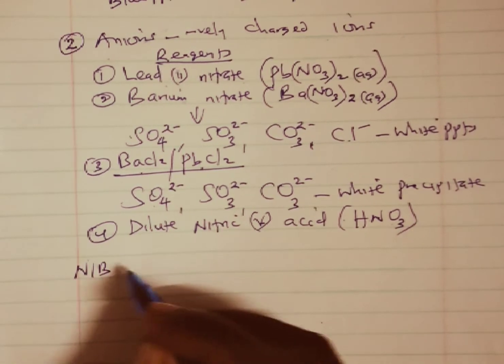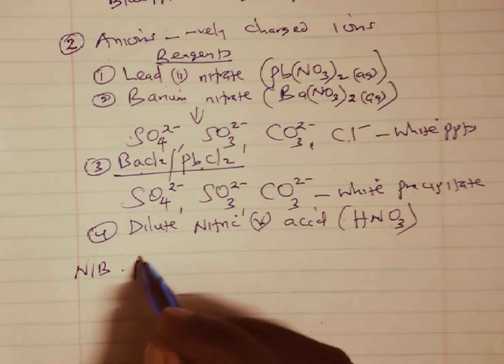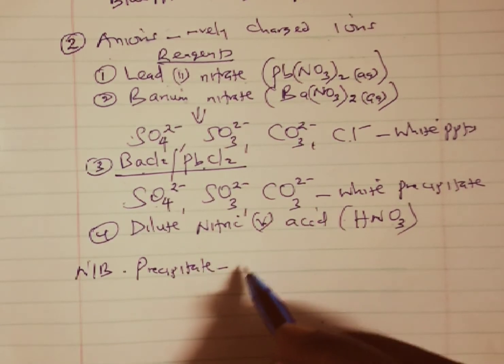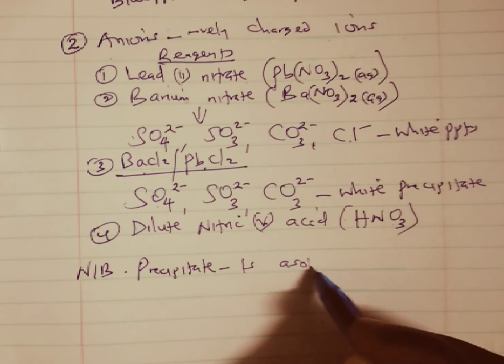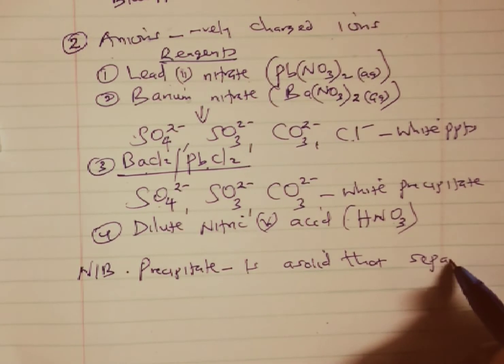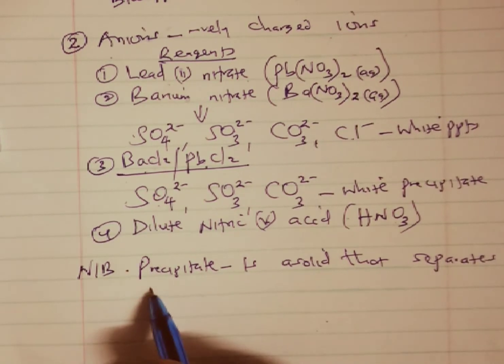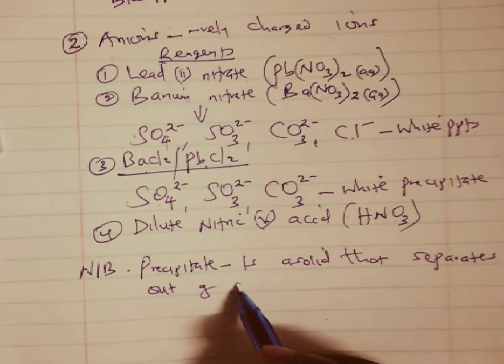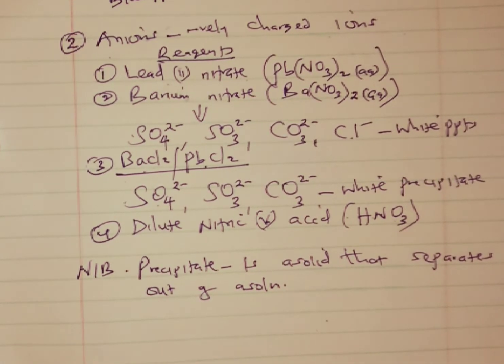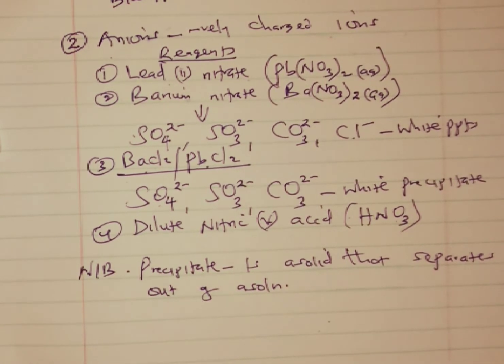NB, a precipitate is a solid that separates out of a solution.